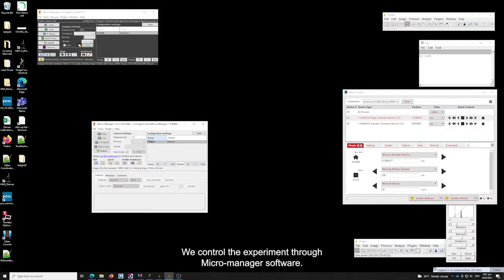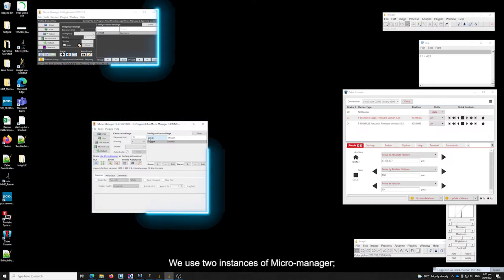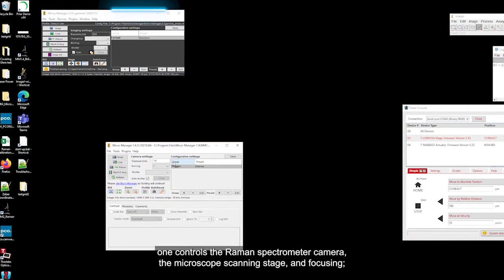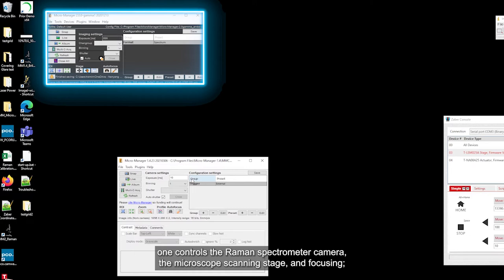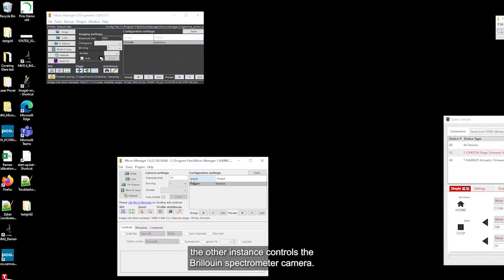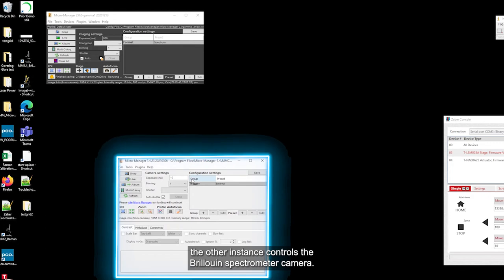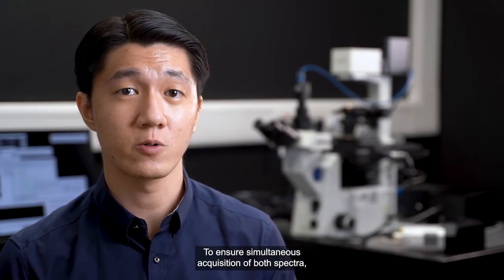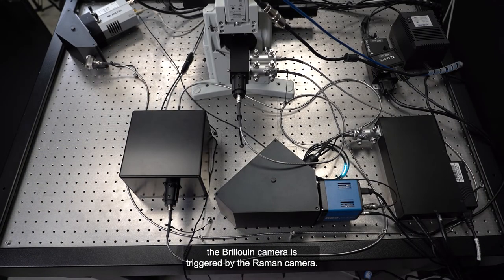We control the experiment through MicroManager software. We use two instances of MicroManager. One controls the Raman spectrometer camera and the microscope scanning stage and focusing. The other instance controls the Brillouin spectrometer camera. To ensure simultaneous acquisition of both spectra, the Brillouin camera is triggered by the Raman camera.